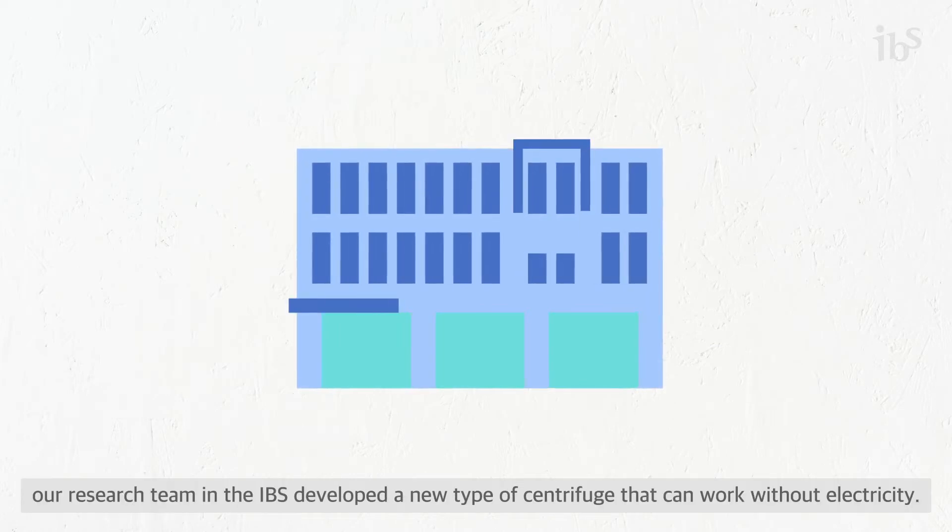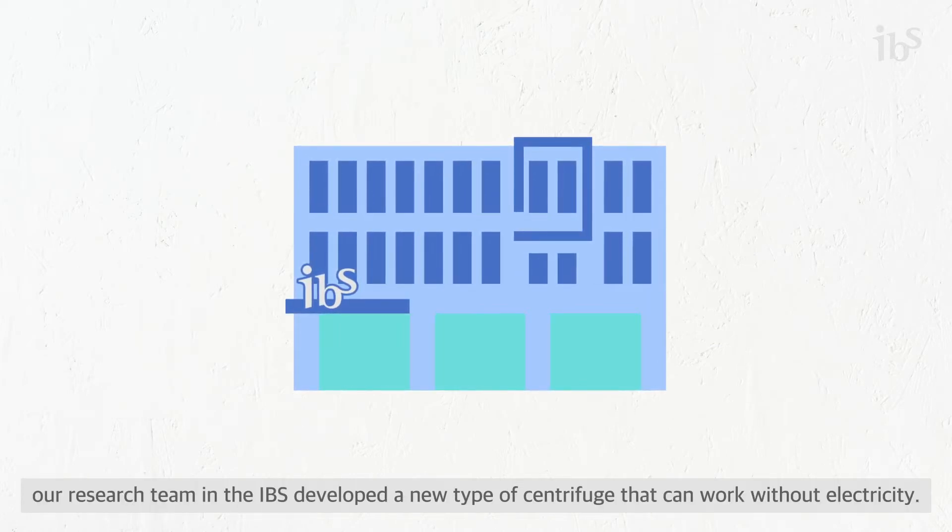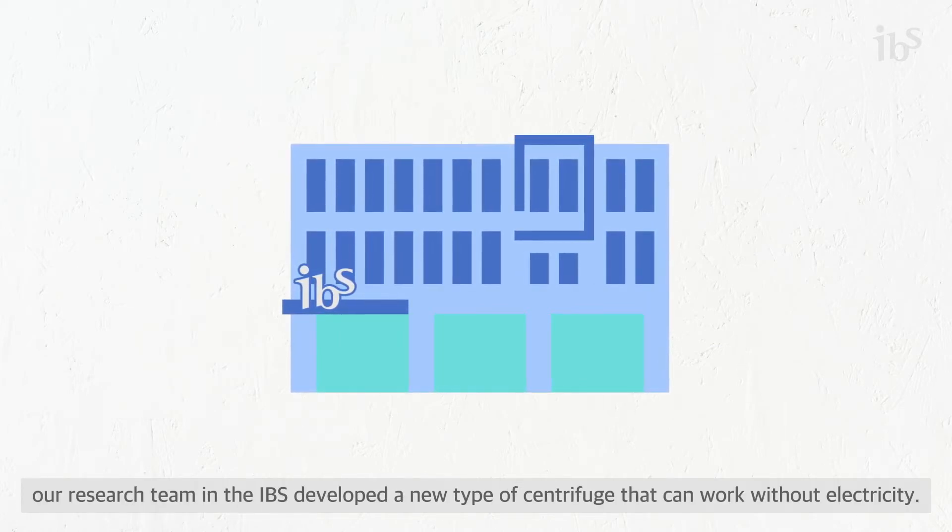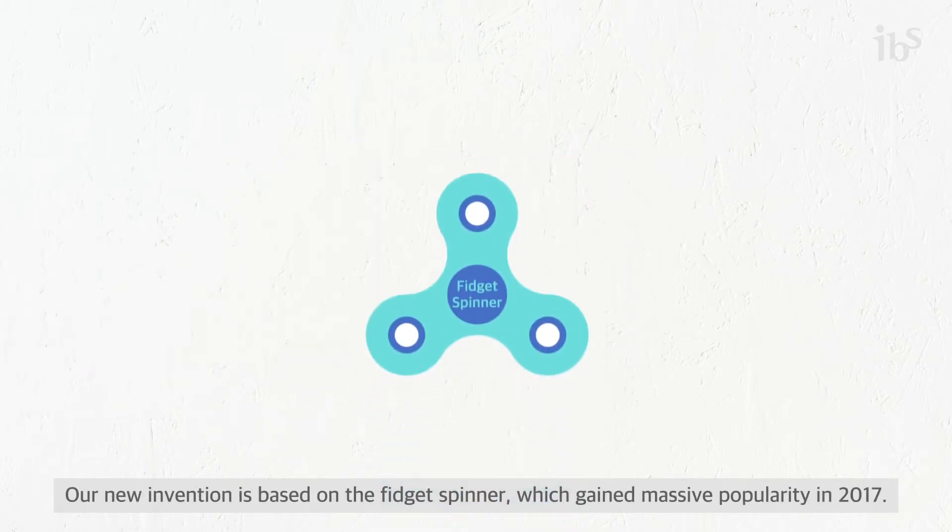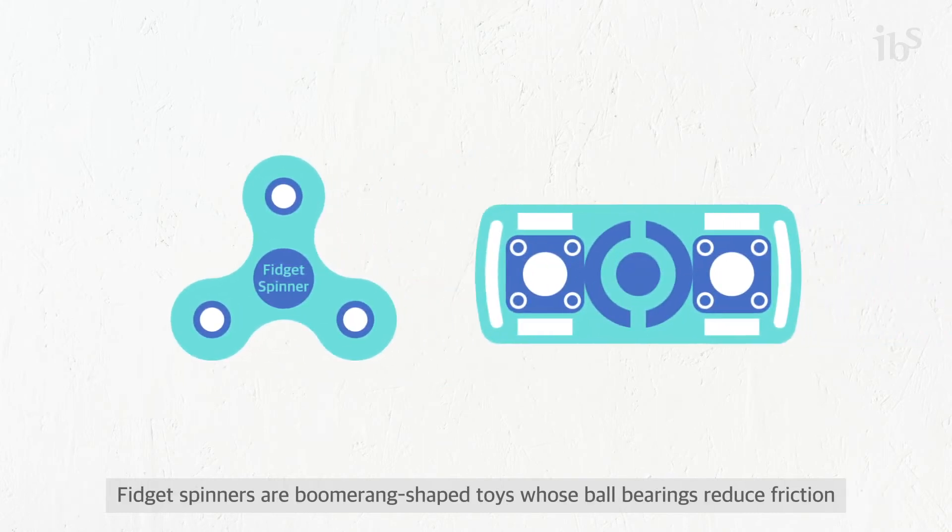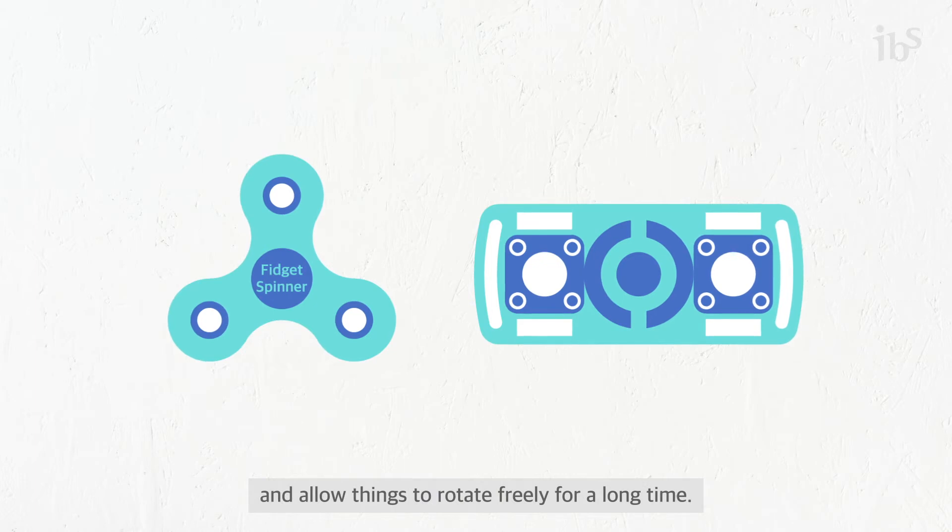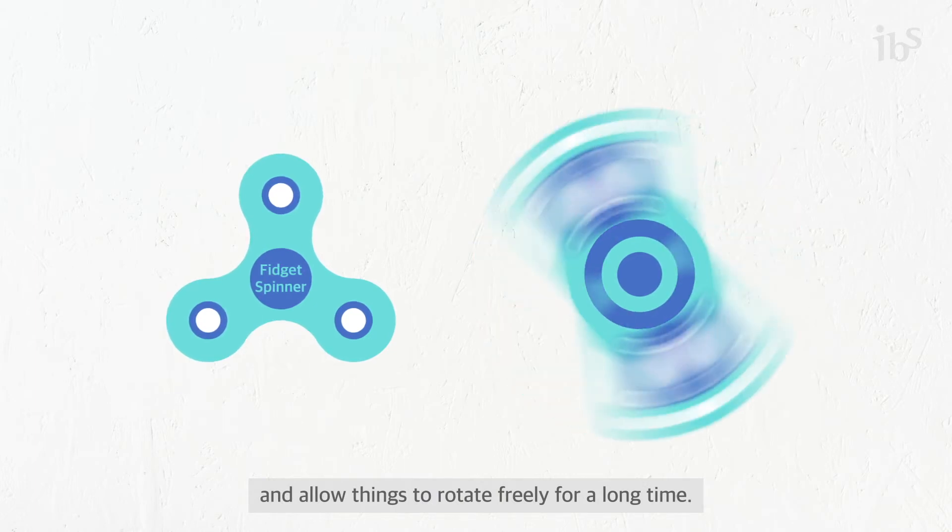In order to address this problem, our research team at the IBS developed a new type of centrifuge that can work without electricity. Our new invention is based on the fidget spinner, which gained massive popularity in 2017. Fidget spinners are boomerang-shaped toys whose ball bearings reduce friction and allow things to rotate freely for a long time.